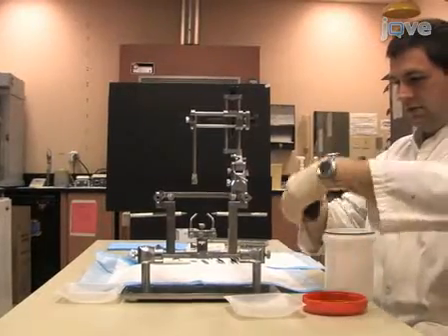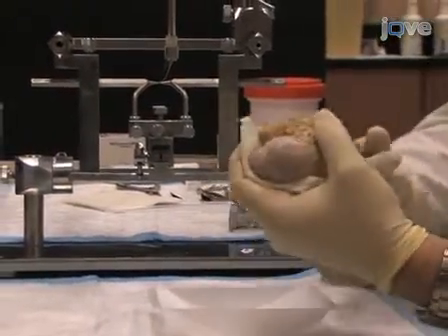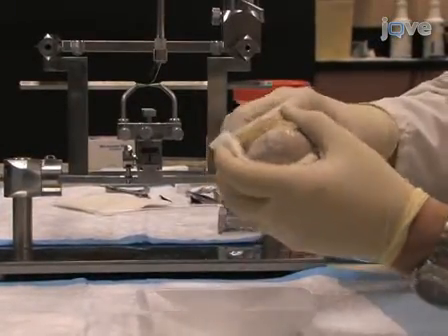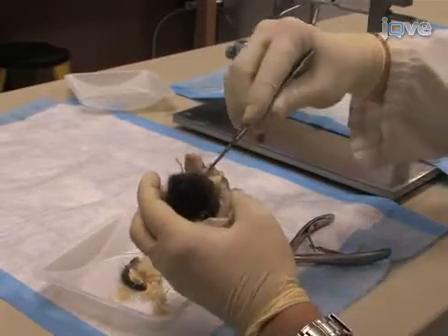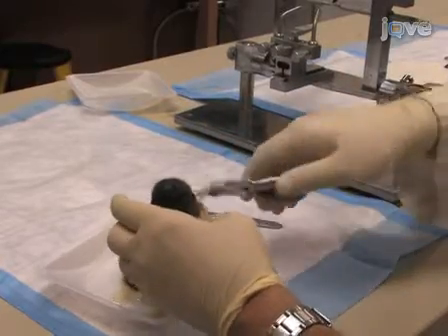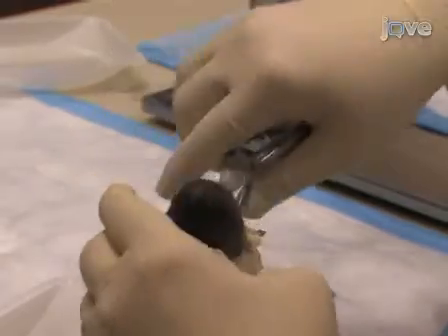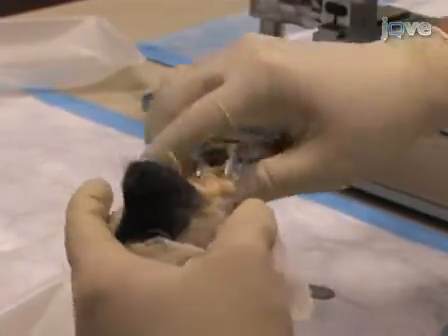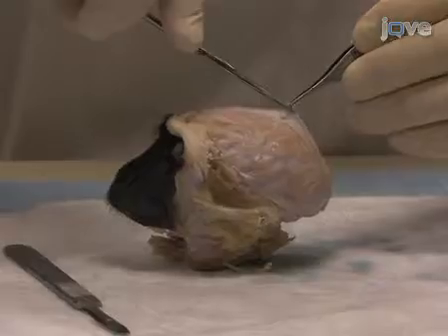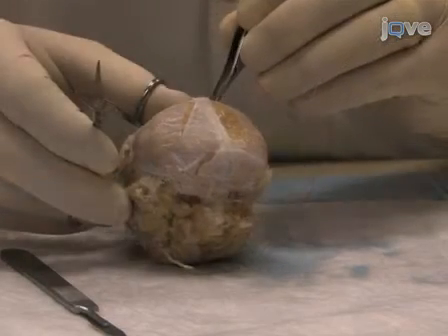Next, prepare the head to go into the stereotaxic frame. Use bone rongeurs and a scalpel to remove the lower jaw. At this point, chip away any remaining calvaria. Throughout these steps, be careful not to remove the temporal bones, since you will need the ear canals intact to anchor the head in the stereotaxic frame. Using forceps and scissors, carefully cut away the visible dura mater from the exposed brain.